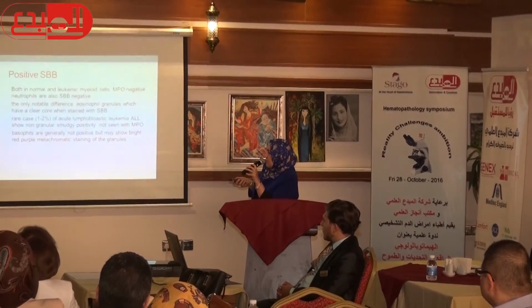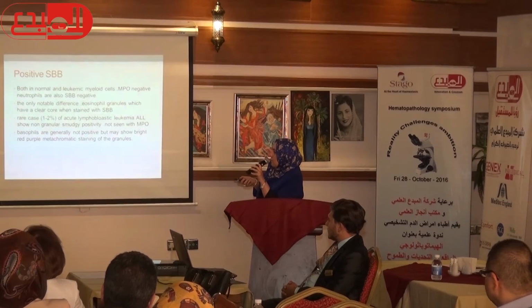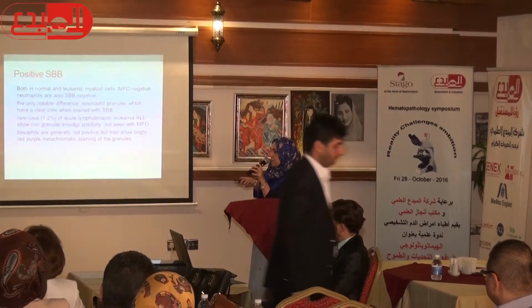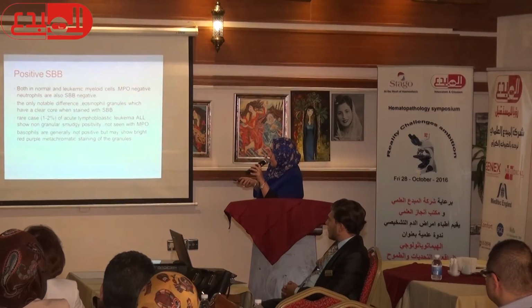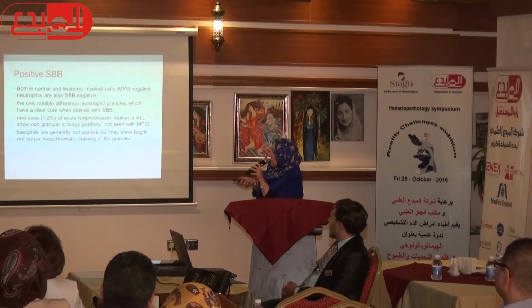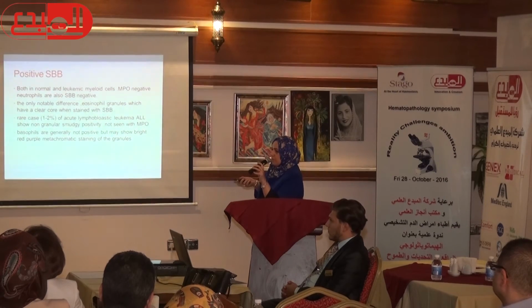Positive Sudan Black B is seen in both normal and leukemic myeloid cells. MPO-negative neutrophils are also Sudan Black B negative. The only notable difference is that eosinophil granules have a clear core when stained with Sudan Black B.